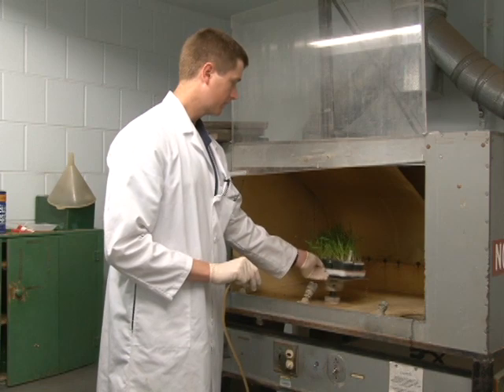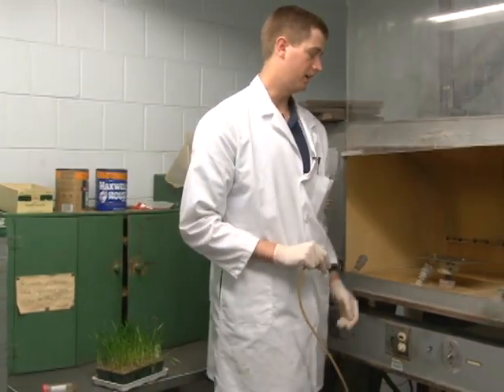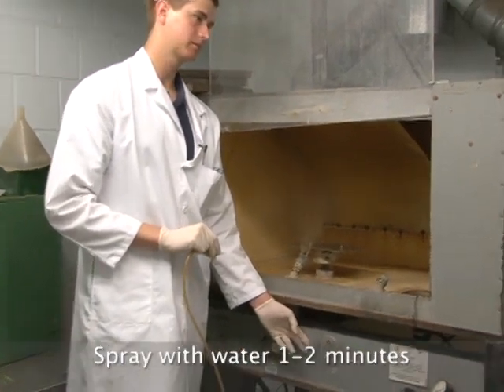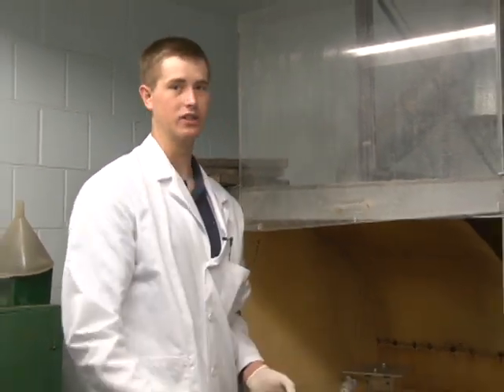I'm going to take out this tray, and to sterilize this inoculation booth we can turn on the automatic sprayer. Now if you don't have this automatic sprayer, you can simply take a water bottle and spray down your inoculation booth.